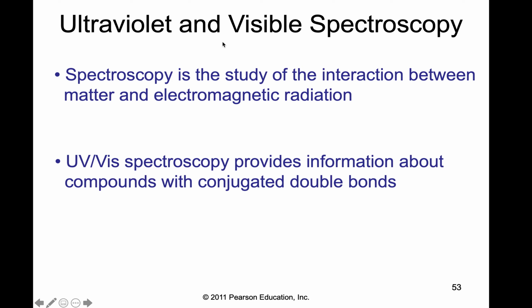And that's all I want to show you with infrared. There's much, much more to this. On an MCAT, a GRE, PCAT, DAT test, national test, if they're testing you on knowledge of organic, they may just show you an infrared spectrum and say, what is this? And you would say, oh, all right, I studied enough to know that's an infrared. You'll be able to differentiate between NMR, infrared, and mass spec by the qualitative appearance of the spectrum or graph shown to you.